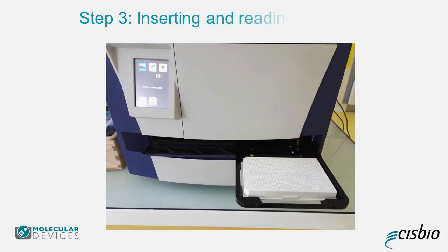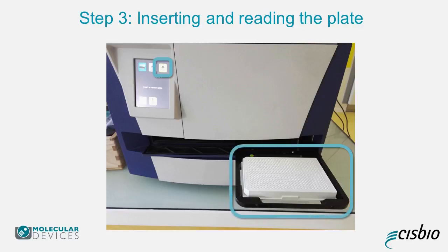Step 3: Inserting and reading the plate. With the experiment setup in Softmax Pro, you are now ready to open the plate drawer on the i3x. To open the plate drawer, press the drawer button on the reader touchpad indicated here. Once the drawer has opened, place the white plate with your samples on the reader carriage. A little reminder: white plates are the only color plate recommended for this reader.